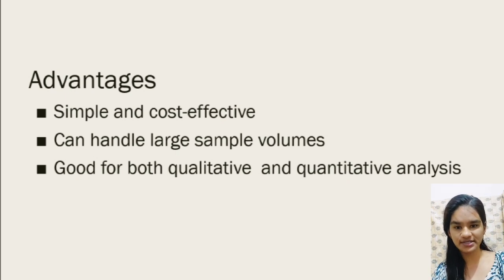Now let's see the advantages of column chromatography. Column chromatography is very simple and cost effective, it can handle a large amount of molecules to be separated, and it is good for both qualitative and quantitative analysis.